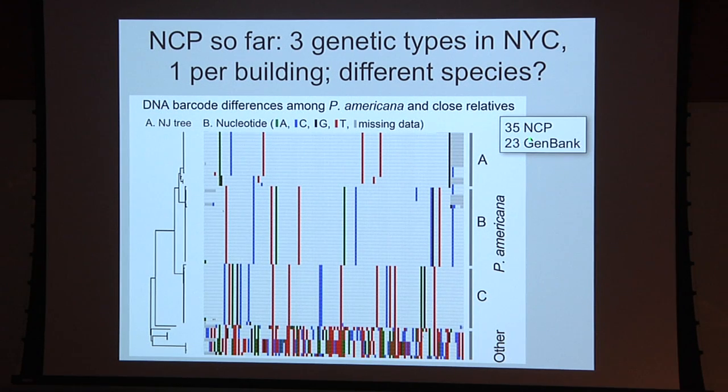And this includes, so we have 35 sequences from the project so far. We have at least 100 specimens to go, and this includes what's in GenBank. So I think GenBank sequences include just 4 from the United States. That's all that's in the databases. The rest are mainly from Iran, Tehran. Primarily someone there wanted to study variation in cockroaches.